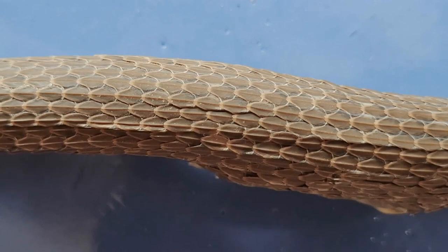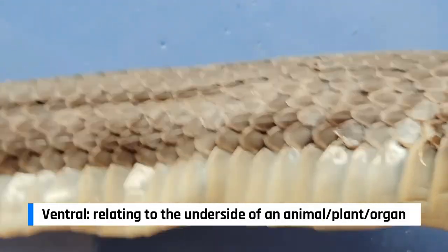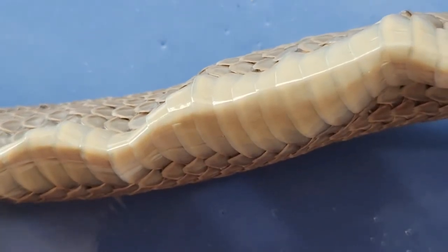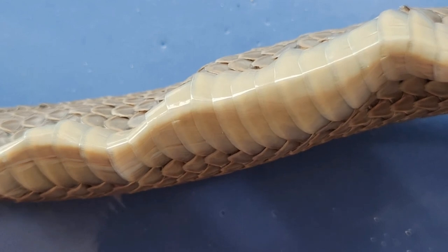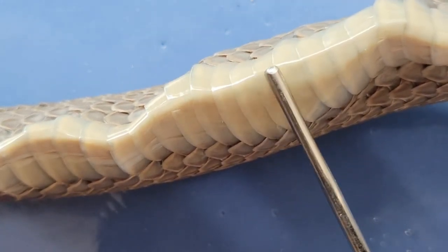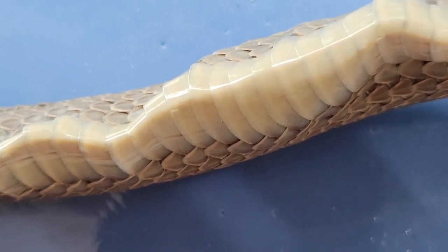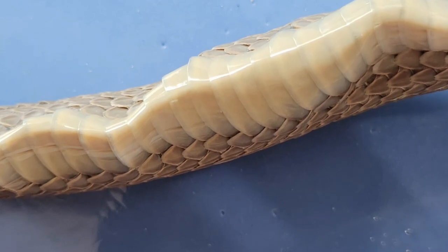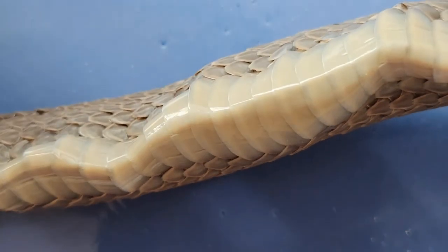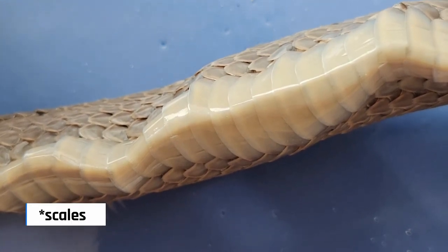Now let's flip over the snake to look at the ventral, or belly side. On the ventral side, the scales look a bit different — they are still overlapping, but they're longer and wider. This is because these scales are specialized to help the snake slither over the ground and to help the snake feel vibrations through the ground to sense its environment.